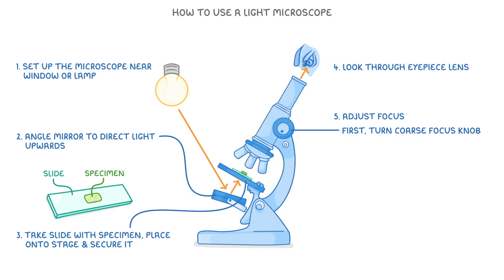And then we can turn the fine focus knob to fine-tune it until we have a clear magnified view of our specimen.